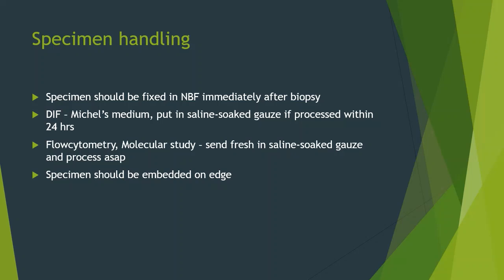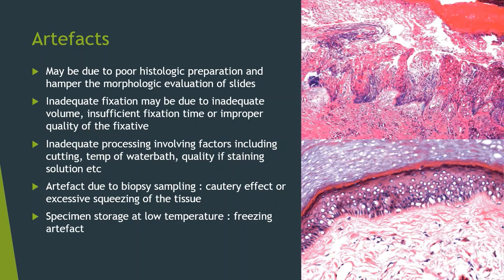Coming to the artifacts in skin biopsy, the artifacts may be due to poor histology preparation that hampers the morphologic evaluation of the slides. There may be inadequate fixation due to inadequate volume, insufficient fixation time, or improper quality of the fixative, and inadequate processing may be there. That includes problems in the cutting, the temperature of the water bath, or the quality of the staining solution. Older staining solution might hamper the proper staining of the skin biopsy.